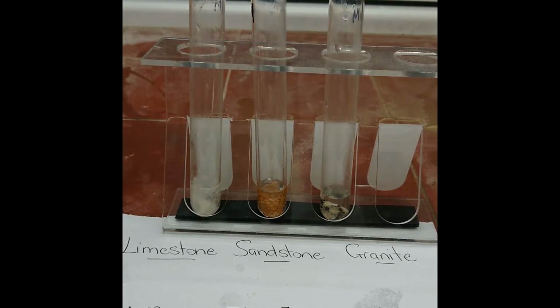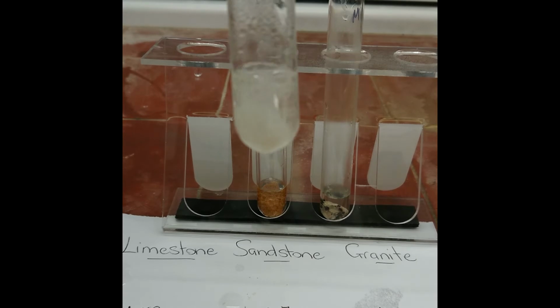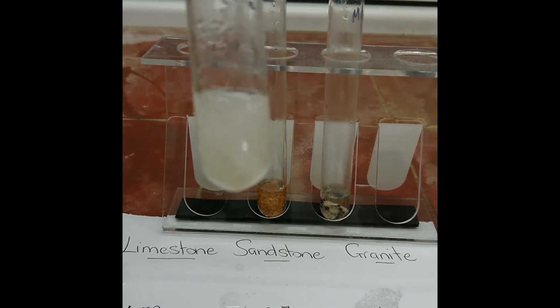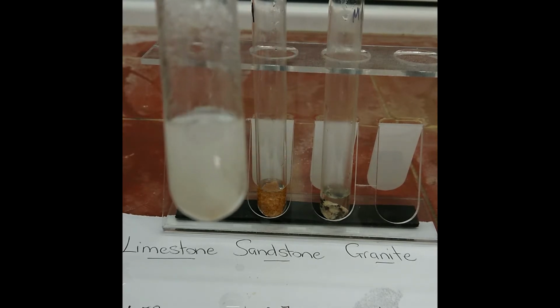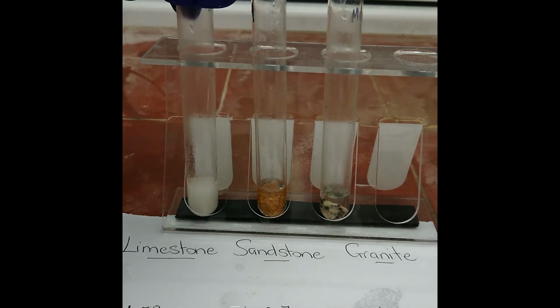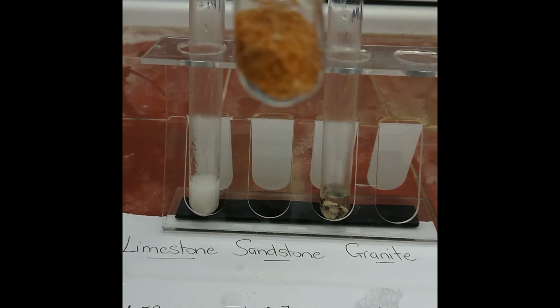As you can see, the most reactive at the moment is the limestone. This is due to the fact that limestone is made out of calcium carbonate. You add acid to calcium carbonate, you receive water and carbon dioxide. Another reason why we are in the fume hood.